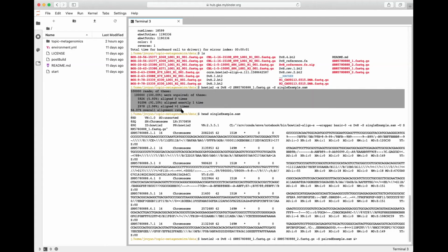So instead of writing it onto the screen, onto the terminal, I'm going to write it into a log file, basically. And if I only had the arrow, then it would only write the output. If I add the ampersand before the arrow, it's also going to write any errors that occurred during the run into the log file, if there were any errors.